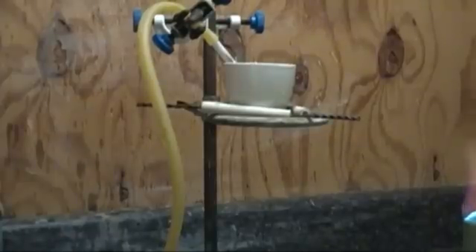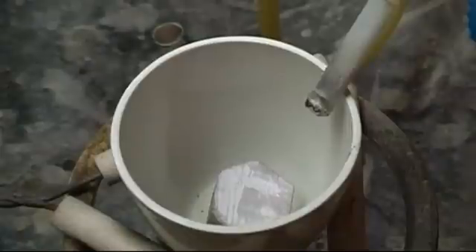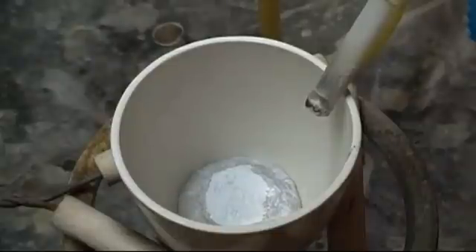I placed a 13 gram piece into the crucible and began to heat it slowly with the Bunsen burner. Sodium metal melts at 97.7 degrees Celsius, a couple degrees lower than water, so it does not take a long time for all the sodium to become liquid.